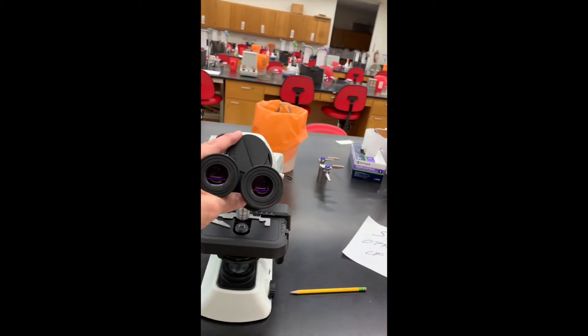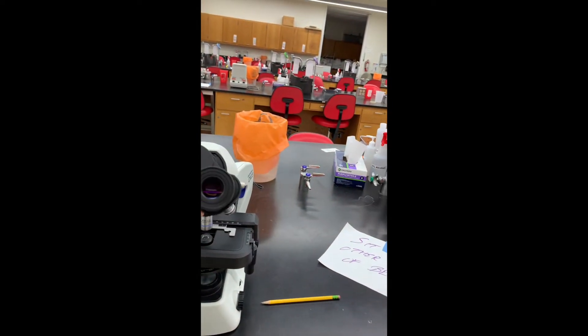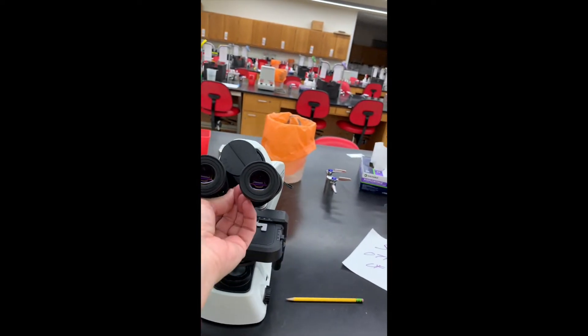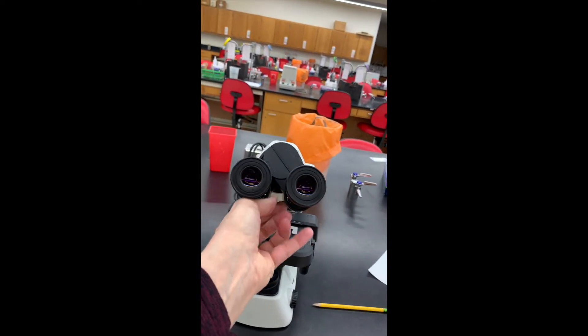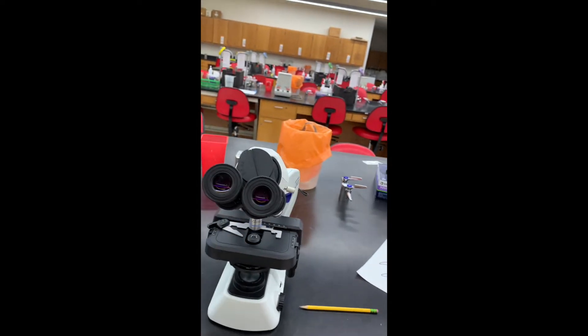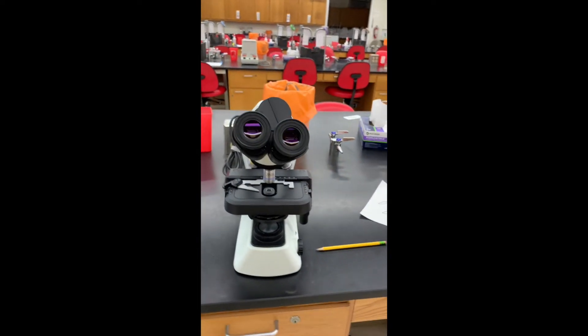You can use the eyepieces and separate them. These are the eyepieces with your 10x ocular lenses in them. You can separate them together or apart for the best fit so you can see through both.